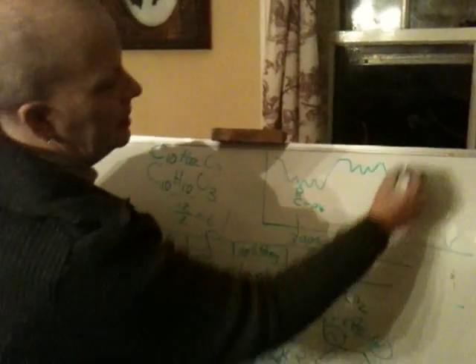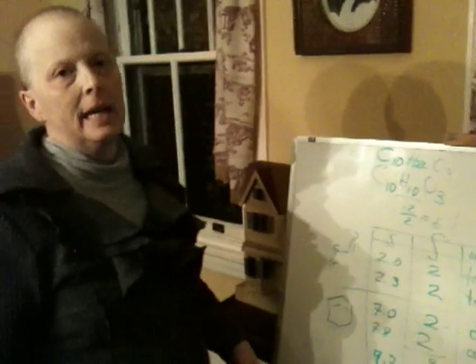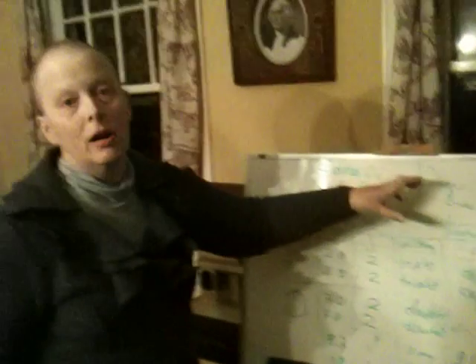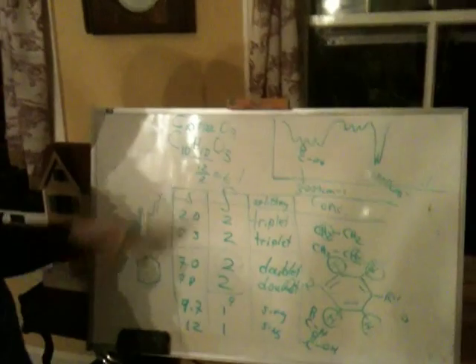And then probably this would actually give 2 spikes at around 1700. And this would indicate, and I'm not saying exactly at 1700, but around there, that would indicate carbonyls in the structure. So that's consistent with these 2 conclusions. Now you might have pulled that right out of the IR. You might have looked at the IR and said, I've got an aromatic right away. That might have been clear to you right away. But regardless, you can interpret it without the IR.